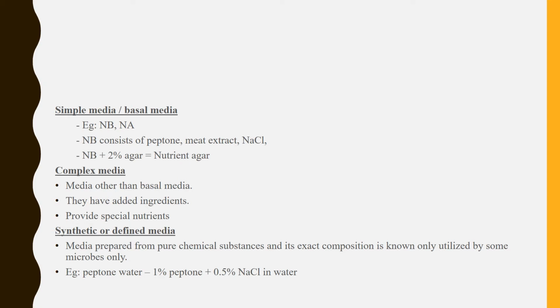So what is simple media? An example of simple media is nutrient broth or nutrient agar. In simple words, the simple media which has peptone, meat extract, and NaCl, which has simple components, is known as a simple media. Simple media is used for the non-fastidious organism, meaning which organism do not have any special requirement for growth, such as E. coli.